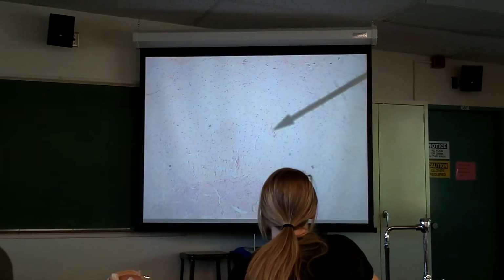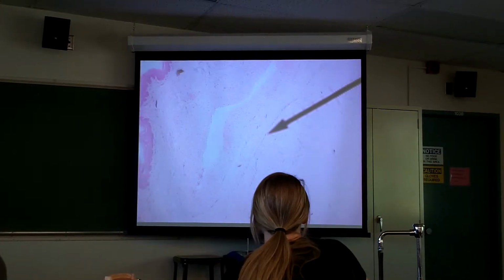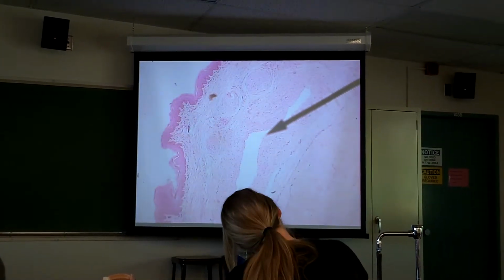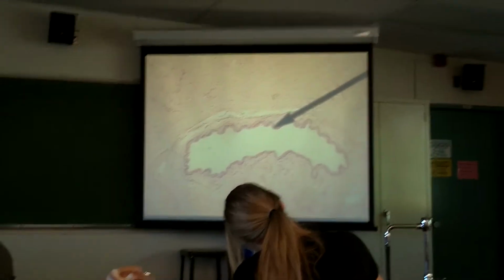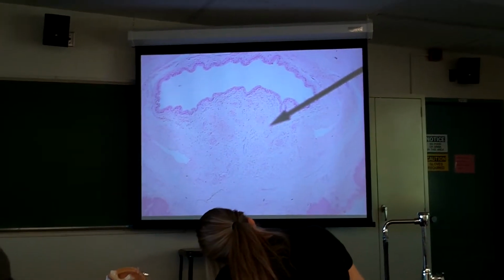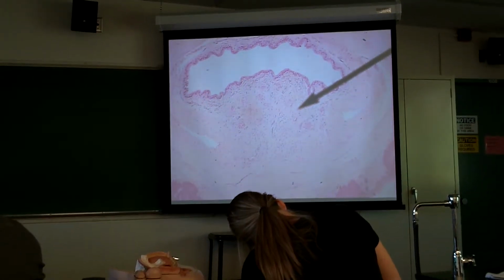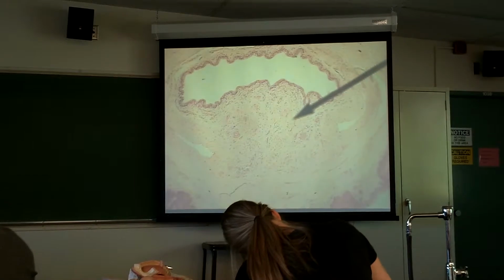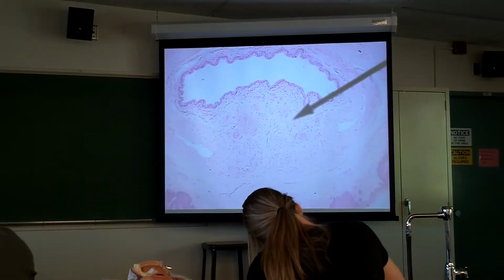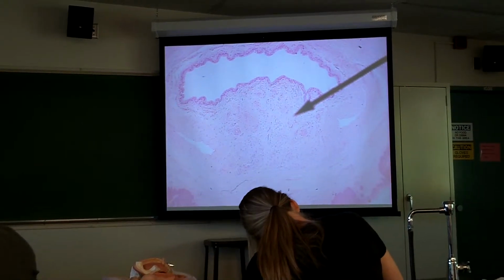All right. So again, corpora cavernosa, some dorsal blood vessels up in this neck of the woods, urethra is down below, and corpus spongiosum is the erectile tissue around the urethra. At what point would you say it's not urethra and it is corpus spongiosum? Outside the purple. Okay. Yeah. So the purple epithelium defines the edges of the urethra.